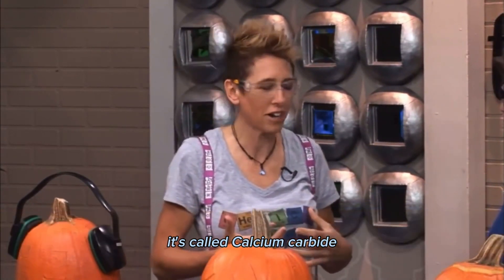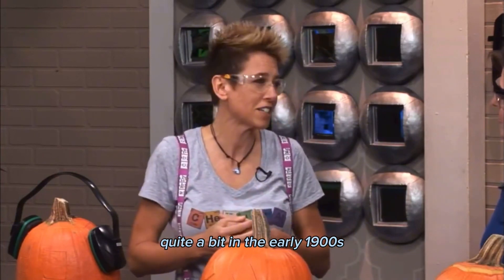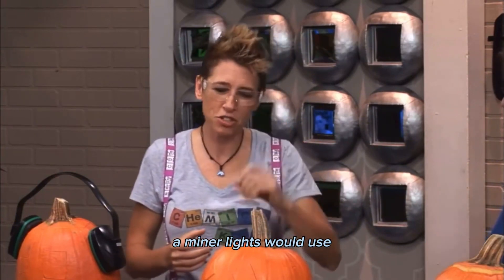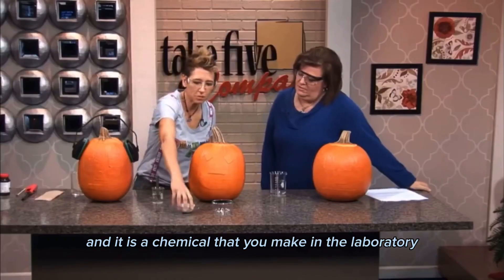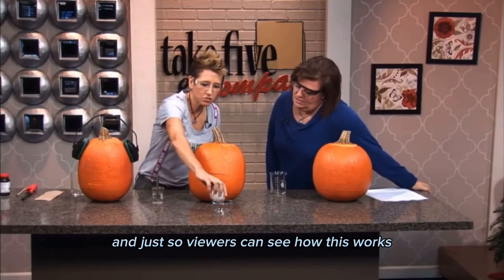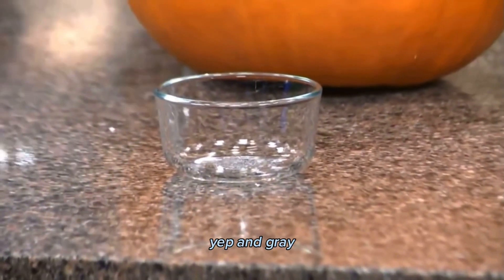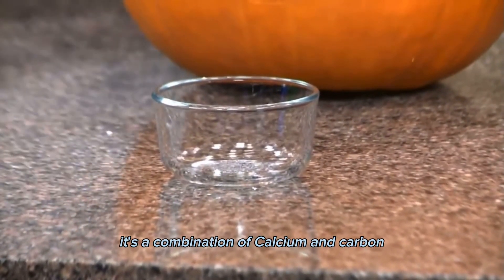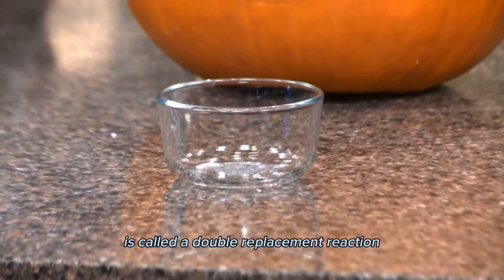It's called calcium carbide, and it was a chemical that was used quite a bit in the early 1900s. Miners would use them for their headlights, and it is a chemical that you make in the laboratory. Just so viewers can see how this works — it's a powdered chemical, kind of gray in color. It's a combination of calcium and carbon. Just to show you how this reaction works, it's called a double replacement reaction.